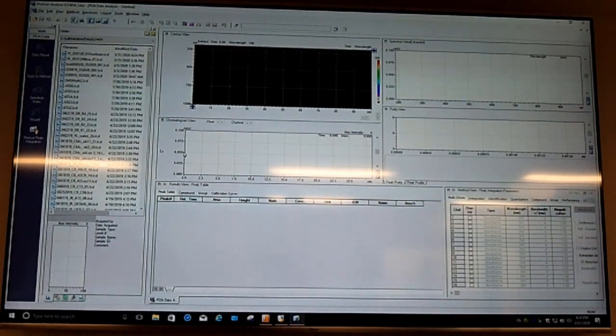And so that's a big window with a lot of information. On this column, it shows all the samples we just ran. And then this window shows all the UV spectra, from 1 minute until 100 minutes, and the spectrum we ran from 190 to 400 nanometers. And then this one shows the real-time spectrum.